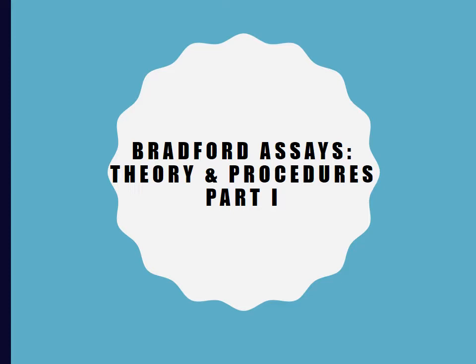Then I'll talk to you a little bit about what you should expect to see in your samples as you prepare them for the spectrophotometer. And then the last part of this video will discuss what to do with all of the absorbance data that you're going to be collecting. So how do you construct the graph, the standard curve, and how do we use that standard curve to determine the protein concentration of your food samples.